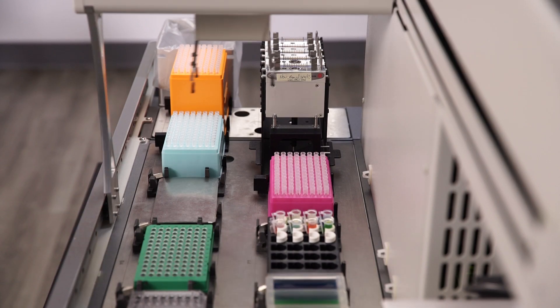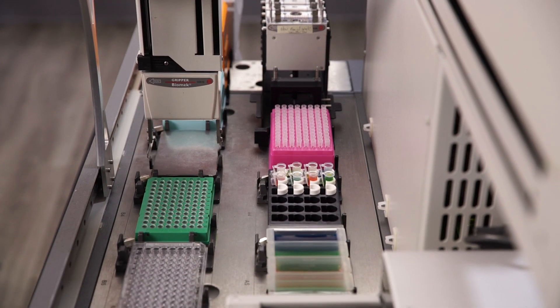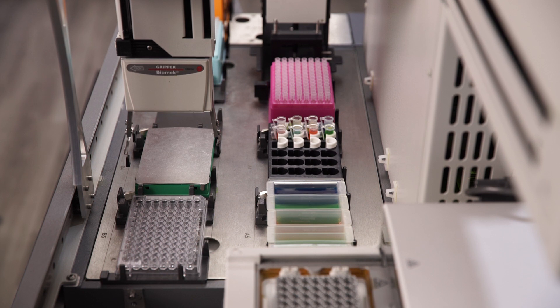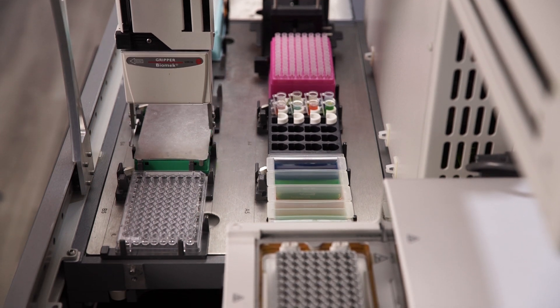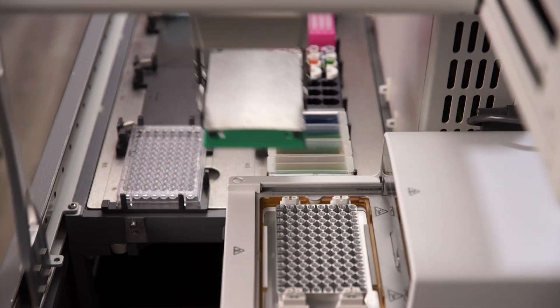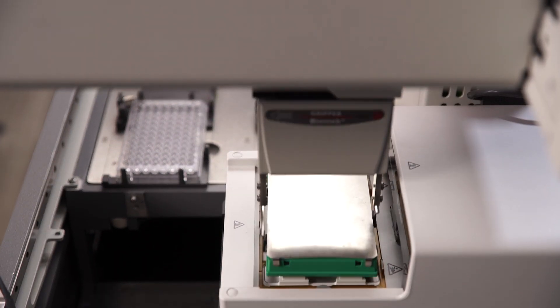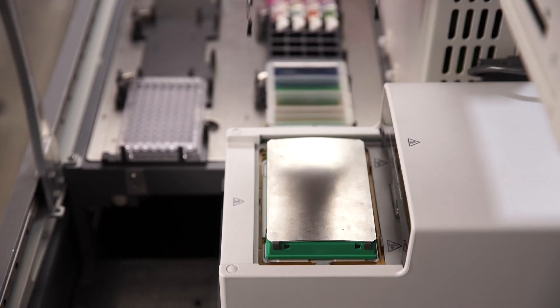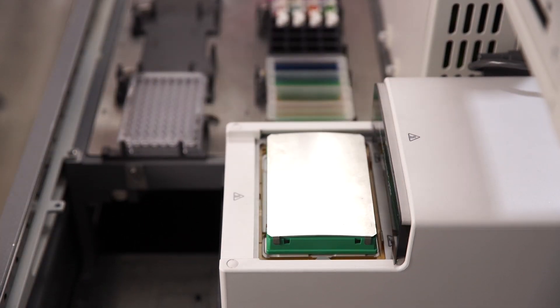The Biomech 4000's gripper tool allows for transport of labware between deck positions as well as off-deck positions for the automation of thermal cycling, shaking, and cleanup, further reducing hands-on time.